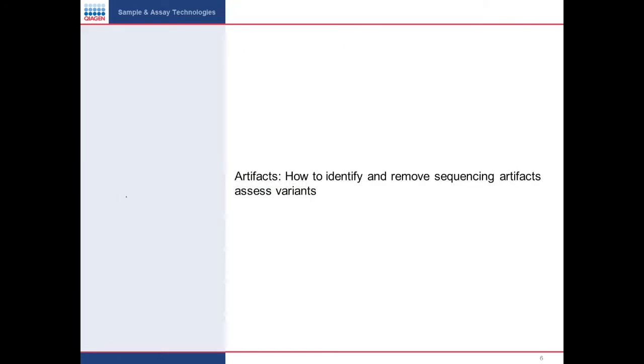The next section that I wanted to cover was artifacts. This has been, since the beginning of variant analysis, an issue for our customers. You know, it's nothing having to do with variant analysis; it's everything to do with the assay of sequencing.